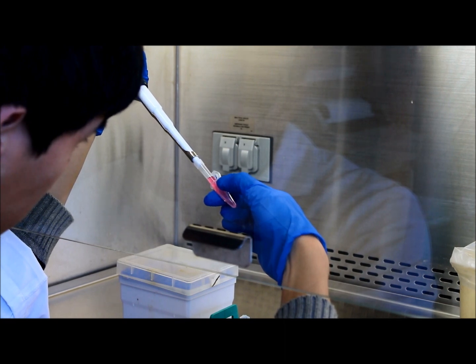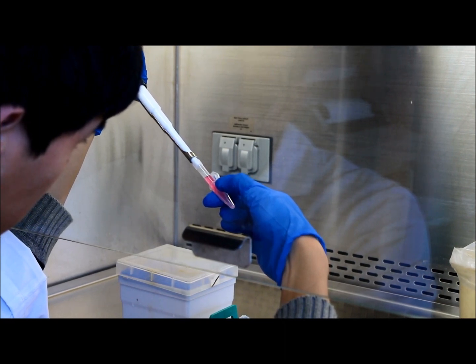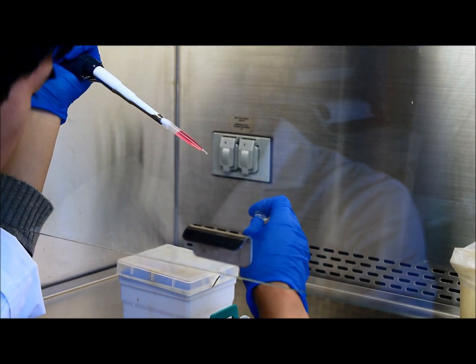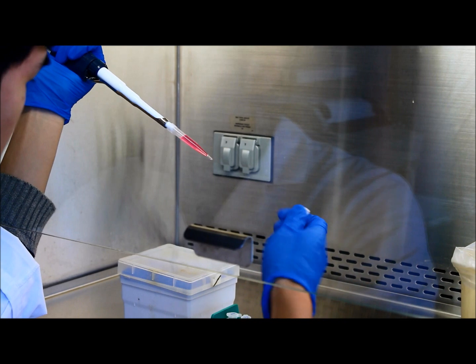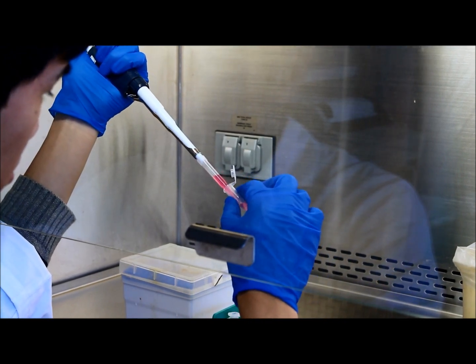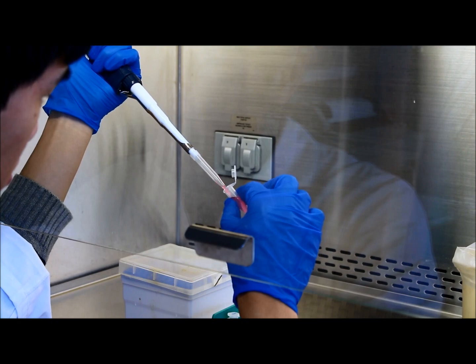Take special care because phenol inside trizol can cause the microfuge lid to loosen. Do not leave the microfuge tube containing trizol inverted or laid down sideways, as the solution may leak.